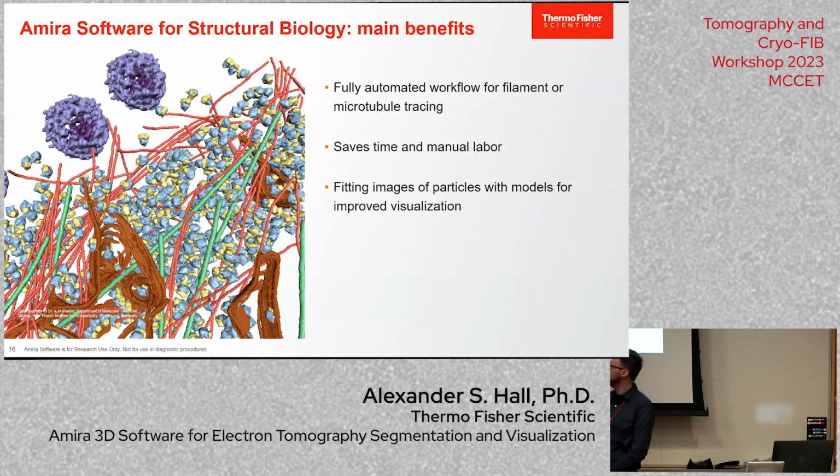Yeah, so for instance, in this illustration, the ribosomes, which are illustrated in Amira as surfaces, were found and rotated according to an external software, actually, full disclosure.